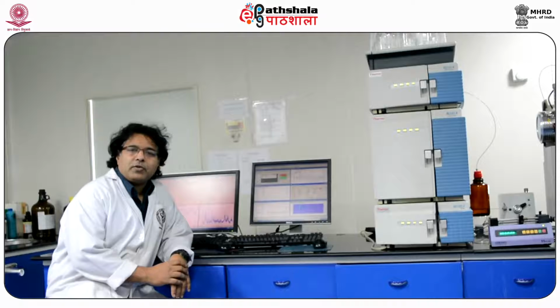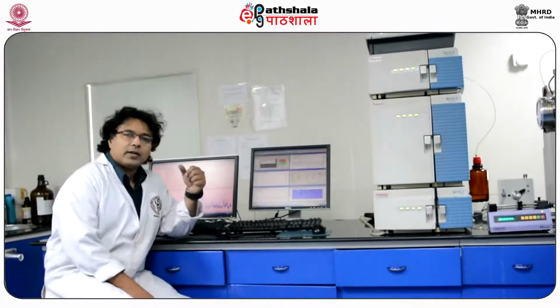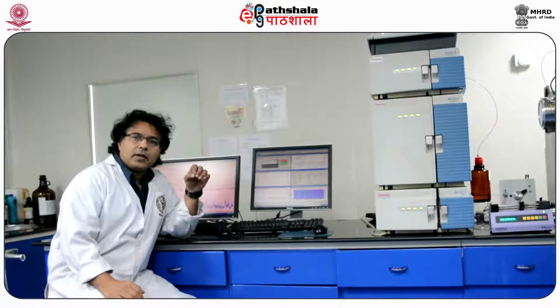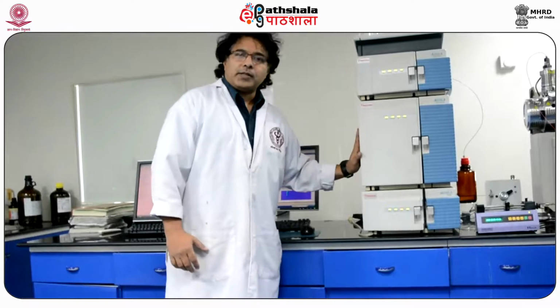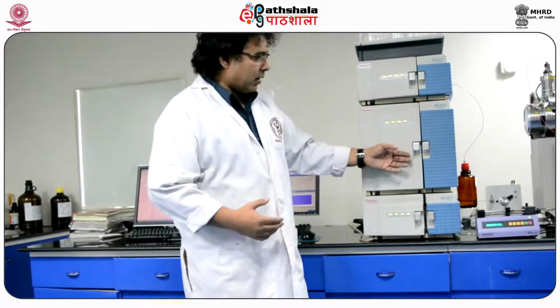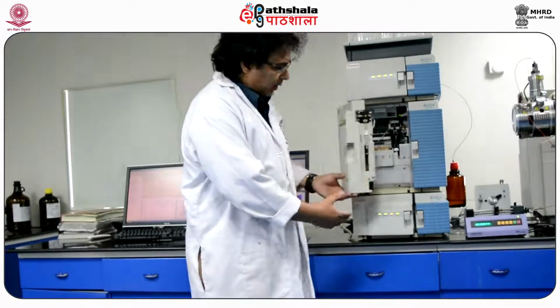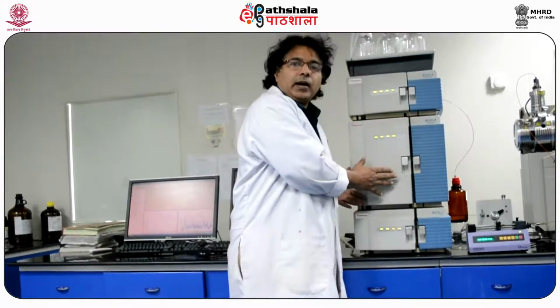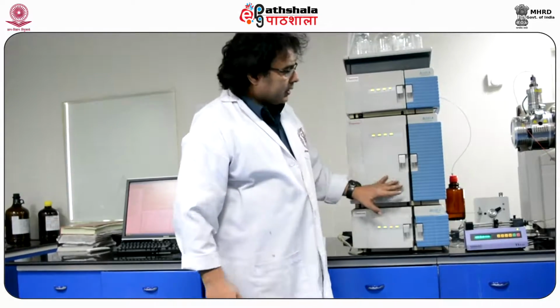There is a lab of high precision bioanalytical laboratory. What you see here is the mass spectroscopy, which is triple quadrupole coupled with tandem mass spectroscopy. What you see here is the HPLC, which is the sample feeder, which tries to isolate the compounds, and this is a complete assembly of it. This is a pump, this is the sample feeder assembly, and this is a detector. And here it is getting separated. It goes to this machine.